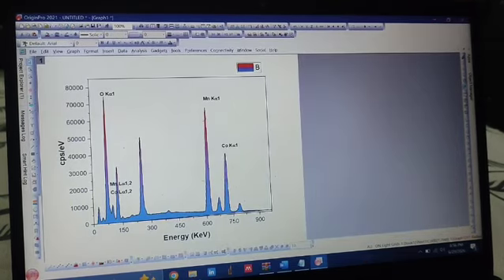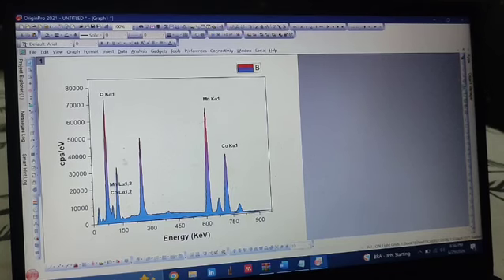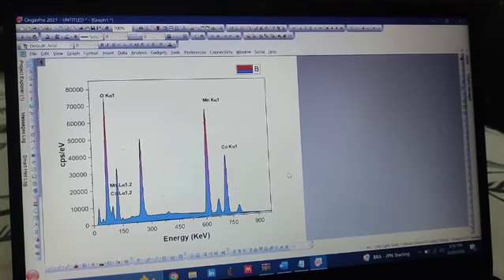And that's it. Your customized EDX graph is now ready. Now you can make changes anywhere and anytime.